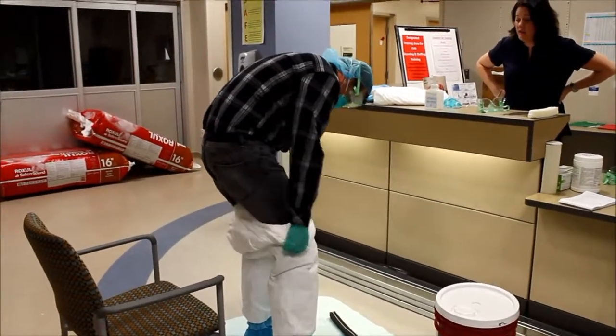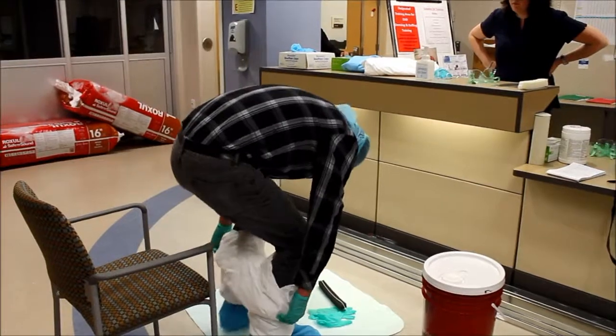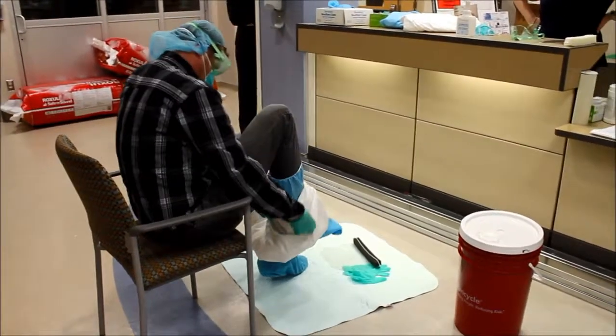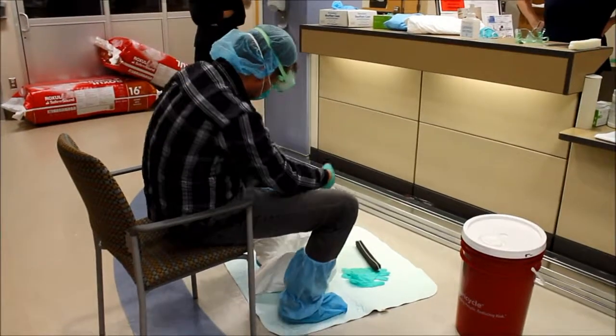You're going to get to the point when you get down to your boots where there would be a chair there for you to sit and remove your boots — your boot covers. Touching the outside again and not your inside scrubs.